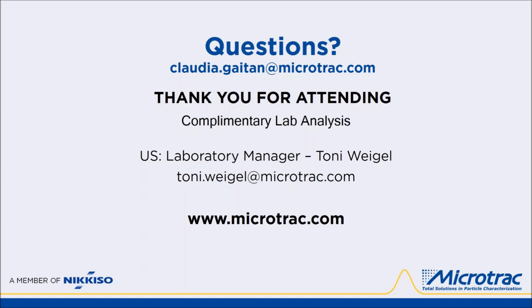They vary in ranges, they vary in the combination of lasers, and they vary in whether they're wet or dry modules or both. So you can look up all that different information on the website. I don't have a table in front of me. Yeah, we also have the brochure as a handout in the control panel on the right-hand side of your screen, which will specify the ranges for wet and dry.